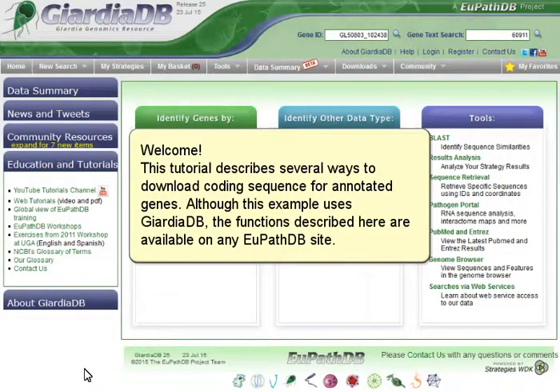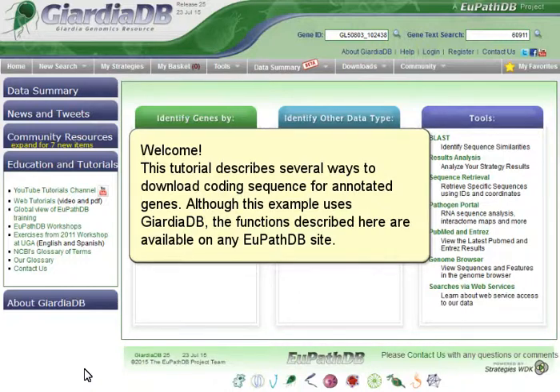Welcome. This tutorial describes several ways to download coding sequence for annotated genes. Although this example uses GiardiaDB, the functions described here are available on any EuPathDB site.